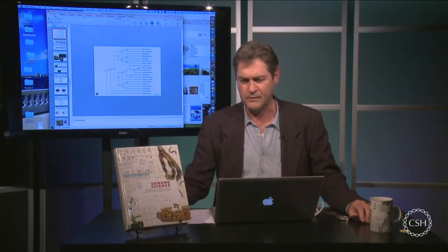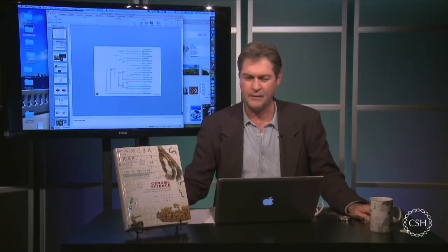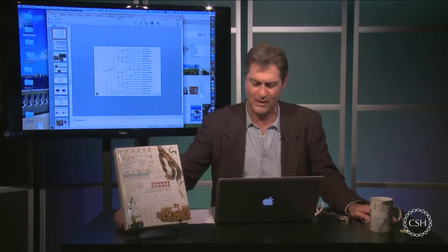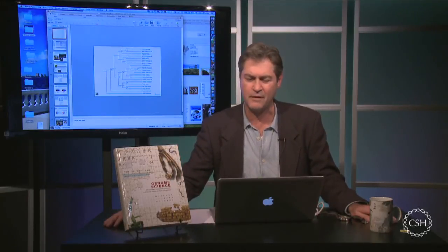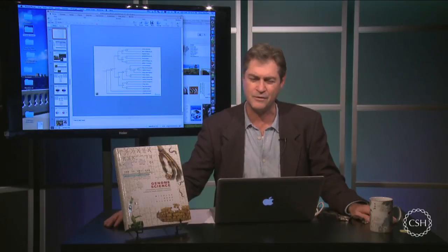But here's what I can tell you. For things that are small, out of the way, and non-charismatic, meaning not great to look at, there's a lot of things that are not in the barcode in GenBank. So, for example, if you look at things, let's say, several millimeters or smaller, of which you'd of course have many algae that would fall into that, I can guarantee you that you will find new GenBank records.